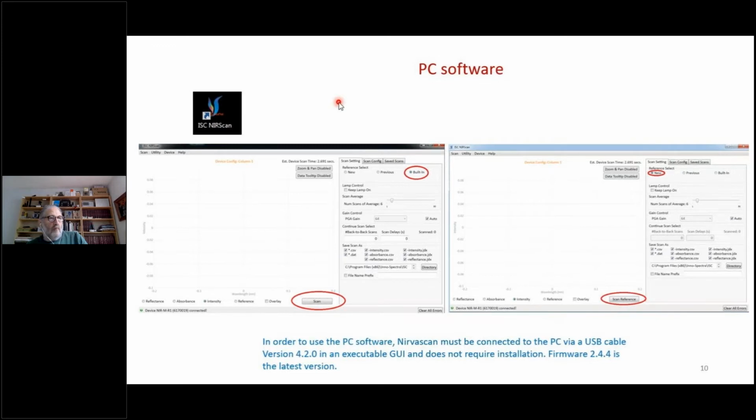Any absorption measurement needs a reference measurement, the I naught of I over I naught. That is already measured in the factory, so you can go ahead and directly measure what you want. But the point is that I naught has been measured with certain parameters. If you want to change those parameters, especially the non-time related parameters, then it's much better to record a new reference, because your reference would not be valid if you're changing the parameters.